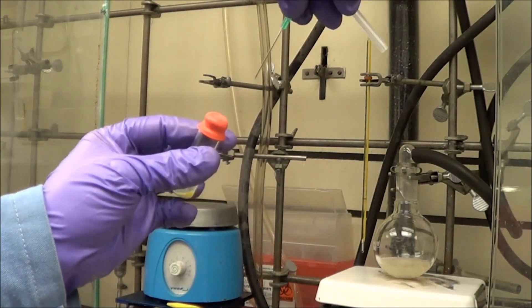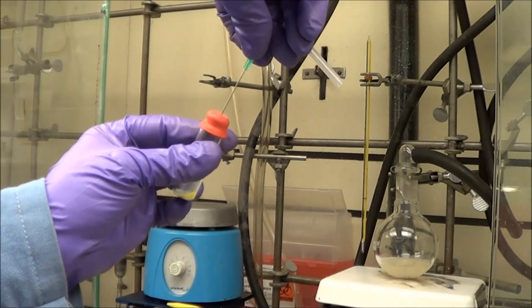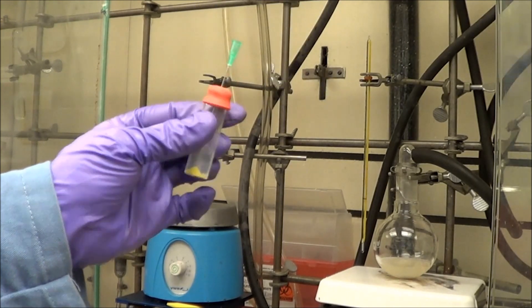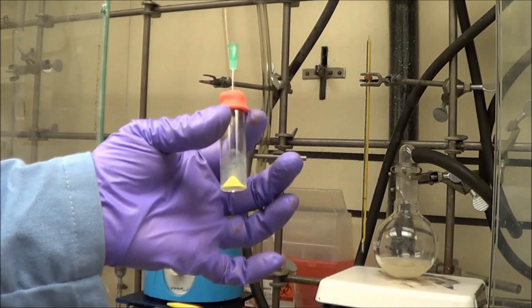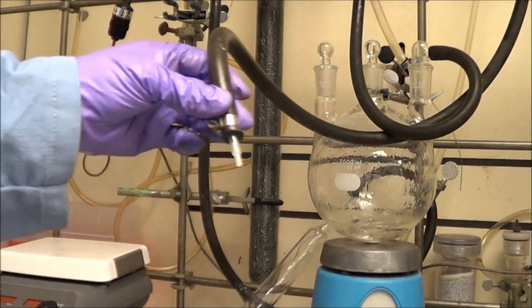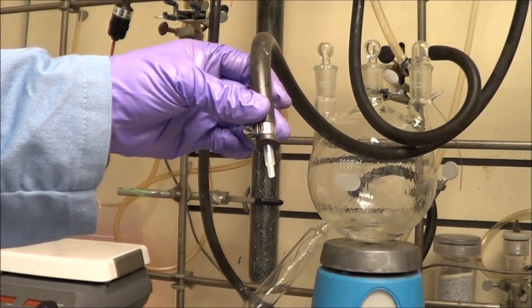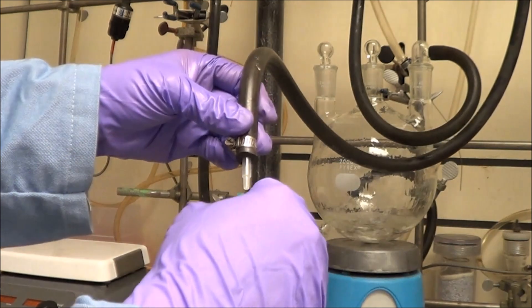I usually use small-gauge needles for this initial drying, and that's because this part is not problematic, but you really want to use a thin-gauge needle when you're pulling off the solvent, which comes next.